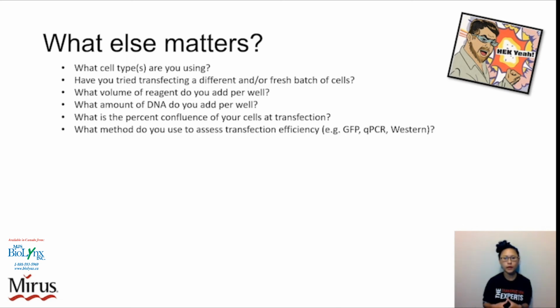What method do you use to assess transfection efficiency? What I mean by this is that your transfection might actually be going pretty well, but maybe there's an issue with the way that you're measuring whether it's going well or not.